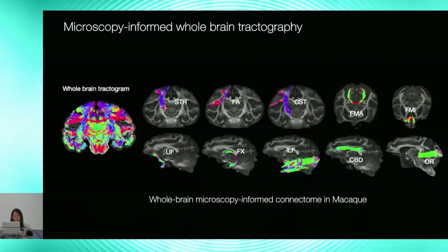And we also proceed to construct the white matter tracts spanning the whole brain. Here we use the X-tract atlas in FSL, which includes 42 tracts. So we can provide more whole brain level microscopy informed orientations. We are also going to provide these whole brain fiber orientations, and you may be able to play around with these orientations after the talk.